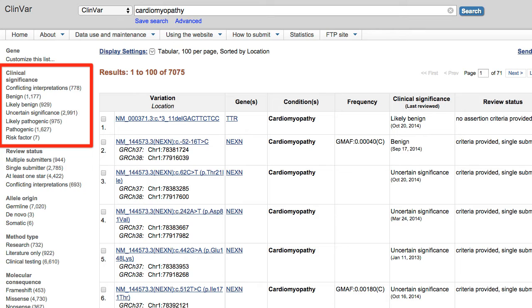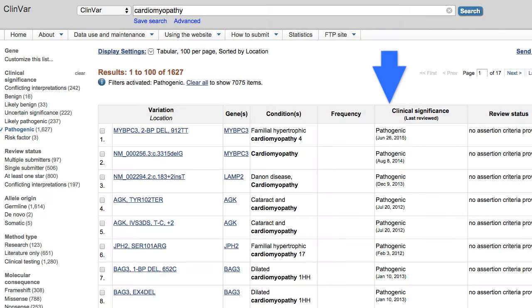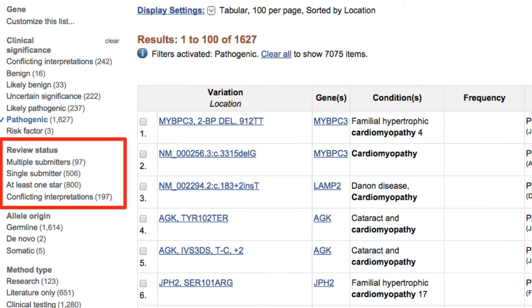If I go into ClinVar and dig a little further, I can see 7,075 hits on the left — all related to cardiomyopathy. The first thing I can filter is what the phenotypic assertion is: pathogenic, risk factor, and so on. For the purposes of this demonstration we're going to select the pathogenic ones. Now we can see that the asserting clinical significance is all pathogenic. ClinVar aggregates these phenotypic assertions of particular variants and considers them more trustworthy when multiple independent submitters have made the same assertion.